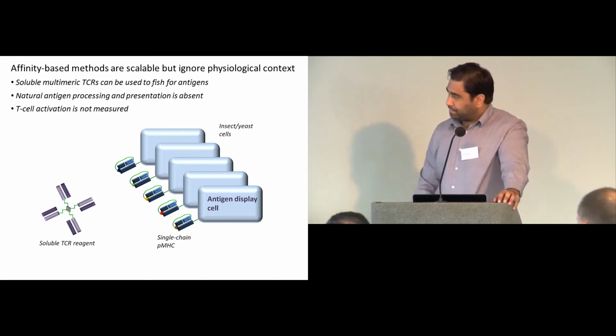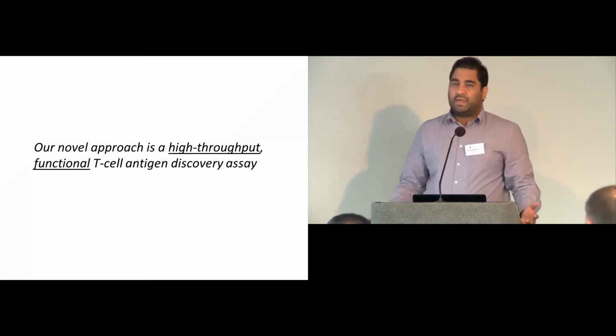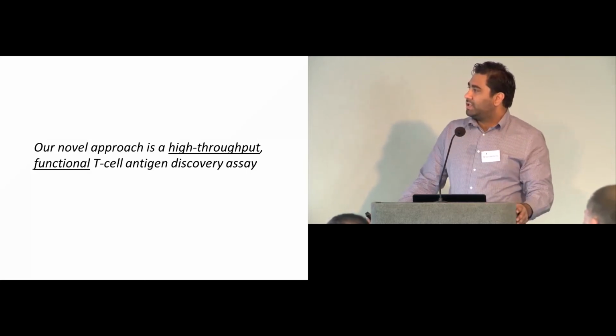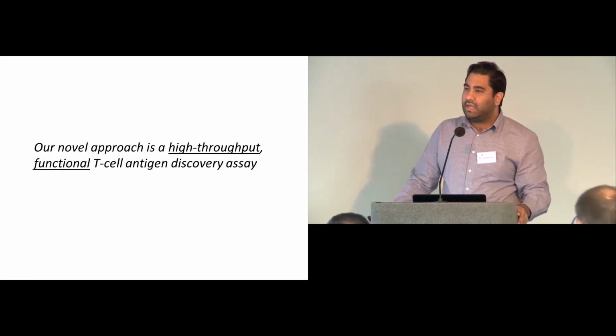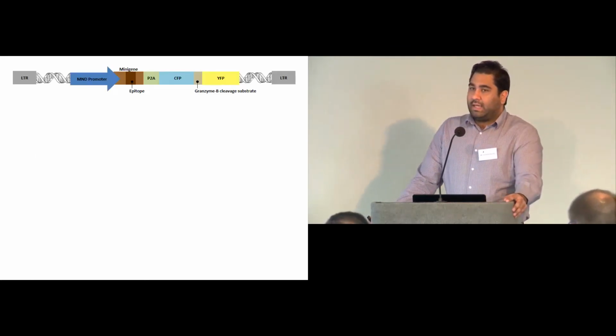So I've developed a novel approach that marries the best of both worlds. It's a high throughput approach, but it also maintains that functional physiological cell-to-cell context. And it works by leveraging the exquisite specificity of the granzyme perforin pathway.